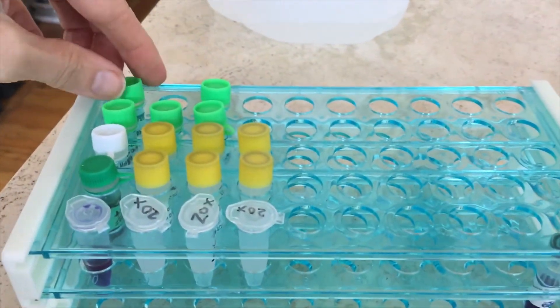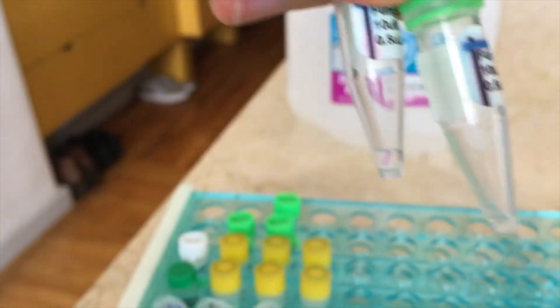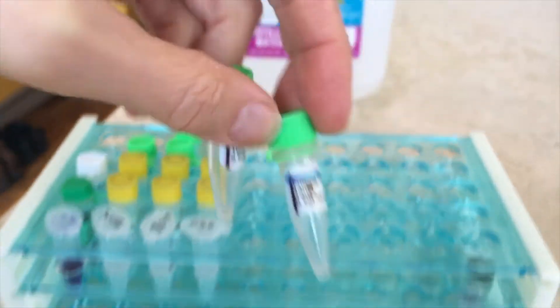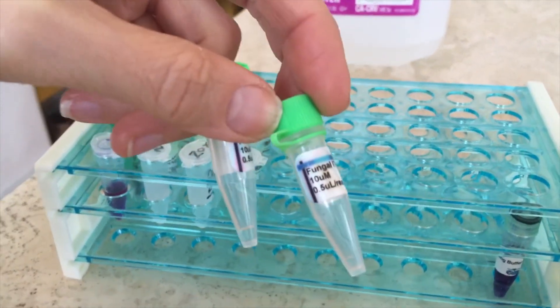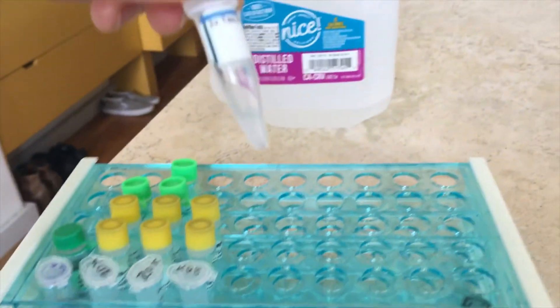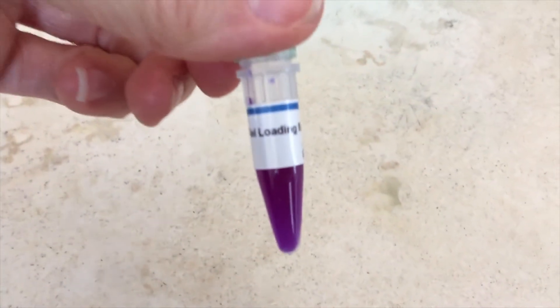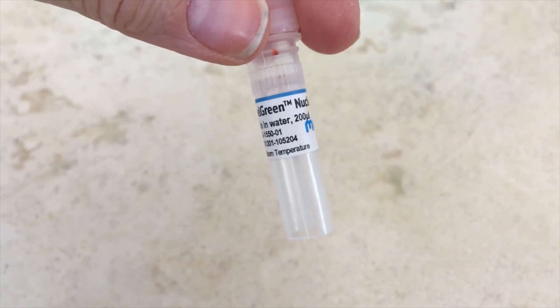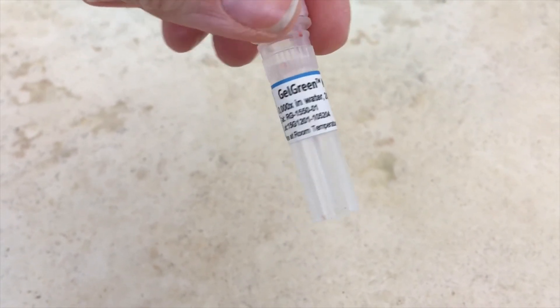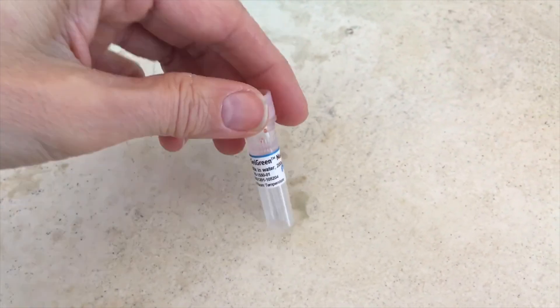Next and last, you're going to need some really specific reagents. You're going to need a couple of fungal primers called ITS1 and ITS4 — those are the really important primers used for most fungal PCR. I bought mine at a place called The Odin, but there are other places online that also sell fungal primers. You're going to need some Mastermix, and you're going to need quite a bit of it — once again I bought mine from The Odin. You're going to need something called Loading Dye or Loading Buffer, which will stain your DNA samples for the gel electrophoresis. And finally, you're also going to need something to stain the agar with — this one's called Gel Green. It's not terribly cheap, but a little goes a very long way. And those are all the reagents you're going to need.